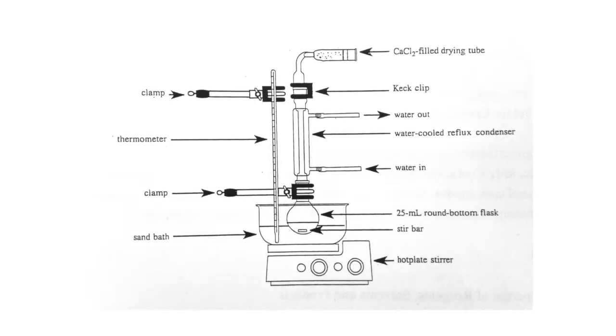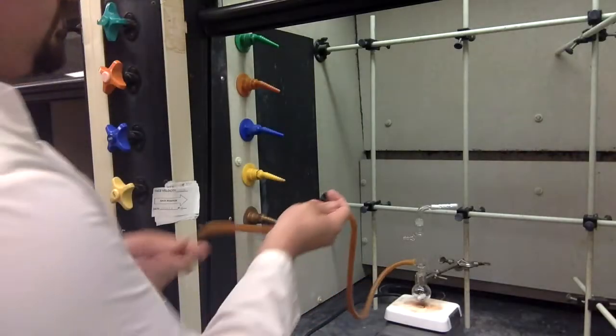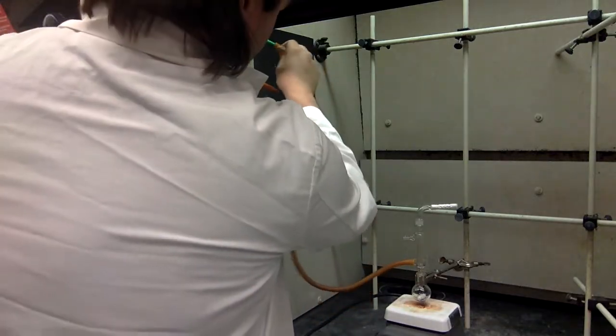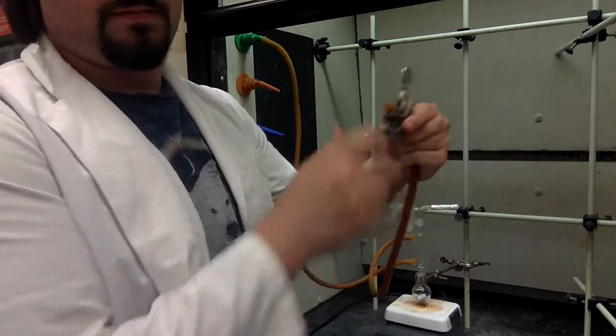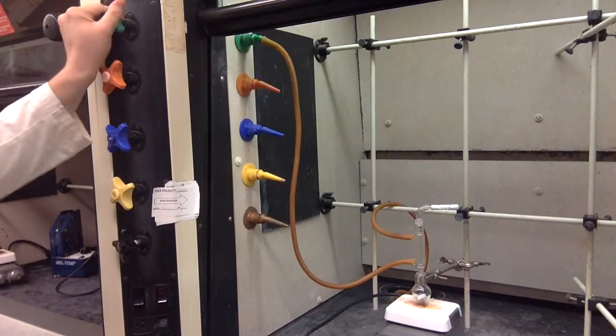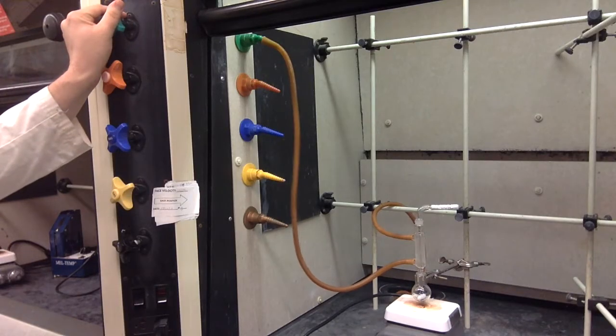When you're ready to assemble your apparatus, grab your round bottom with your magnesium and stir bar out of the white desiccator. Then come over and assemble it as shown. Make sure for the water-cooled reflux condenser, the water is coming in from the bottom and out from the top. I like to use the clamp as a way to hold the tube in the sink. Just make sure you don't clamp it all the way shut. Next, test your system and make sure it's not spraying water all over the place. This looks good.